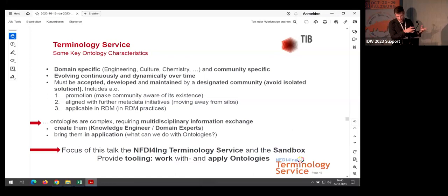And then, as I mentioned previously, if ontologies do not have a strong community behind them, we risk creating work in isolation. If ontologies are created only to share an understanding within an organization or within a department, then we have an isolated solution for that very limited circle. But in my understanding, ontologies are made to work on a common, agreed understanding.